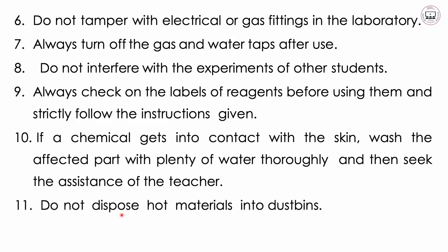11, do not dispose hot materials into dustbins. Some dustbins might catch fire. So as you deposit hot materials in those kinds of dustbins, you might also cause accidents.